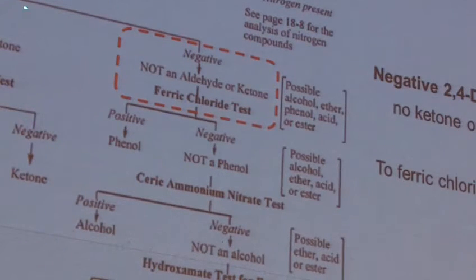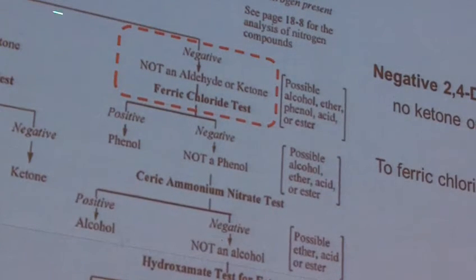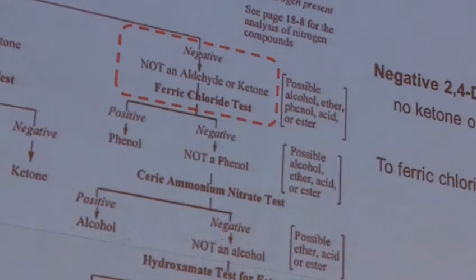If we take a step back, if you had a negative DNP test, so there was no orange precipitate in that reaction earlier, you head over this side, so you know it's not an aldehyde or a ketone, so you can cross those off as possibilities. Now down this side, you do the ferric chloride test. This is another new characterization test for us.